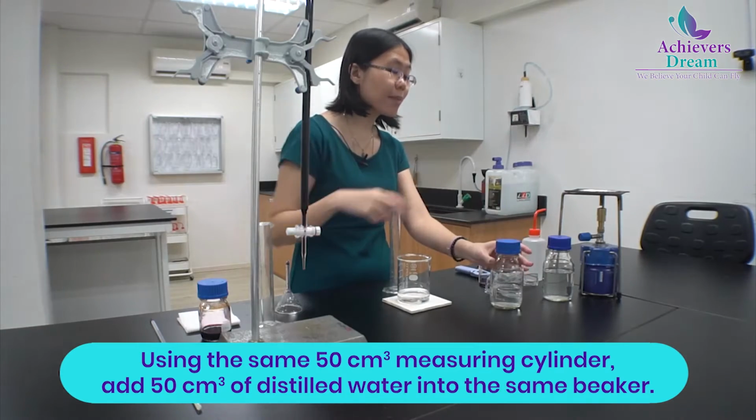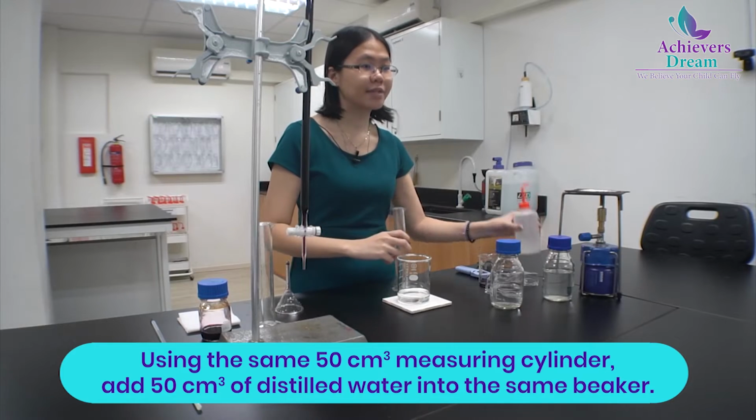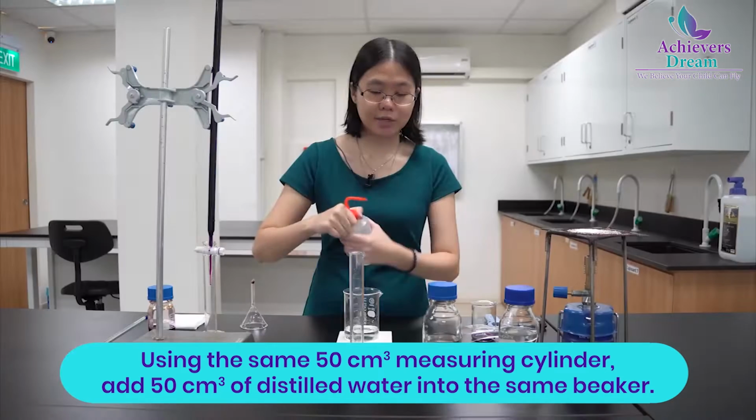So using the same measuring cylinder, measure 50 cm3 of your distilled water inside.